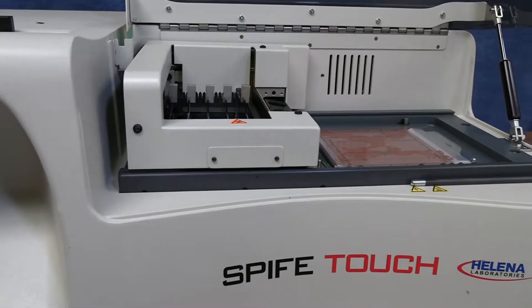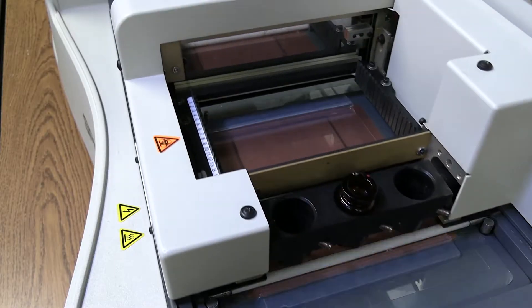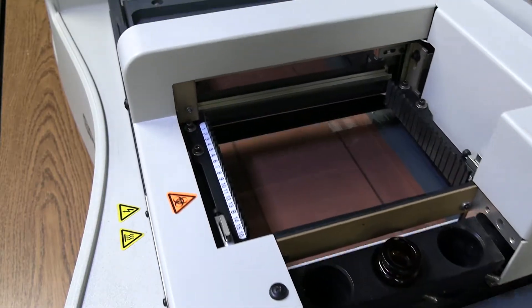Well known for its robust nature and outstanding reliability, the Spiffy Touch performs various steps of electrophoresis with minimal operator interaction.